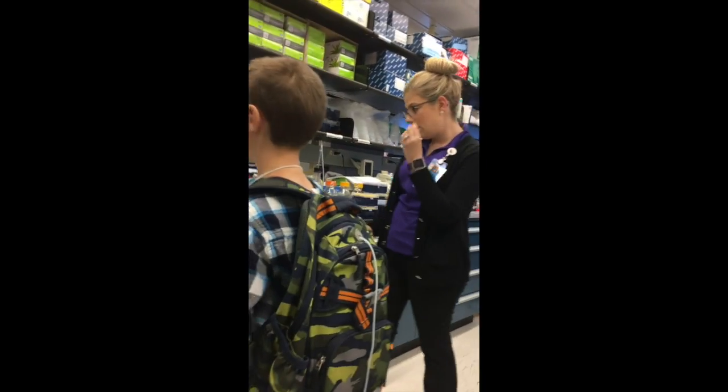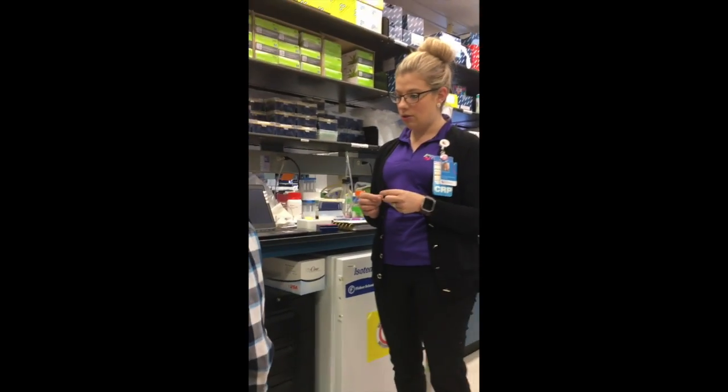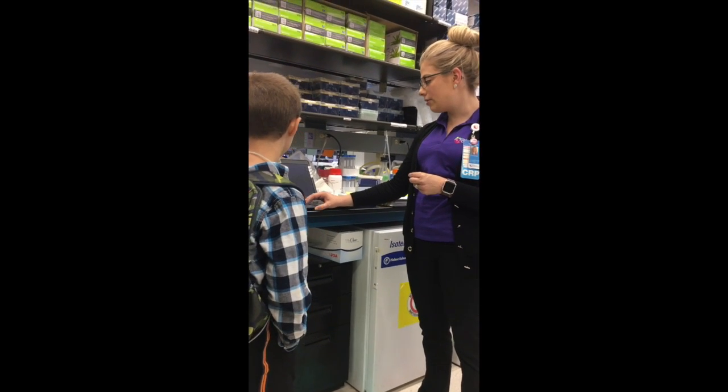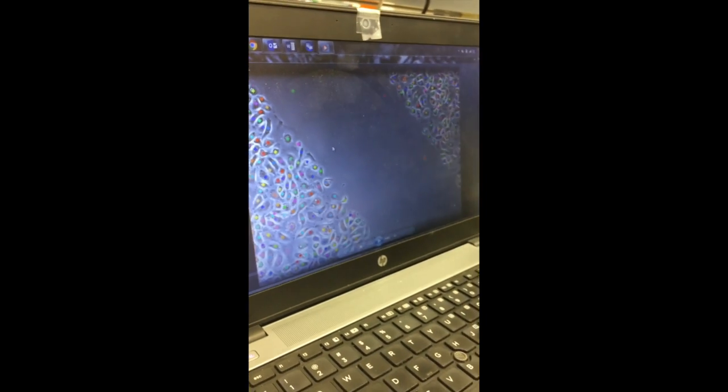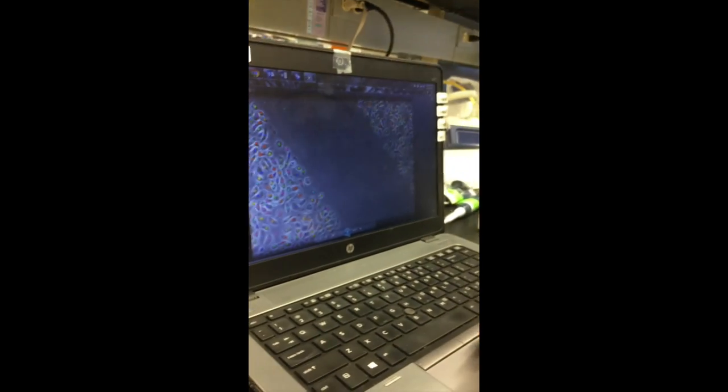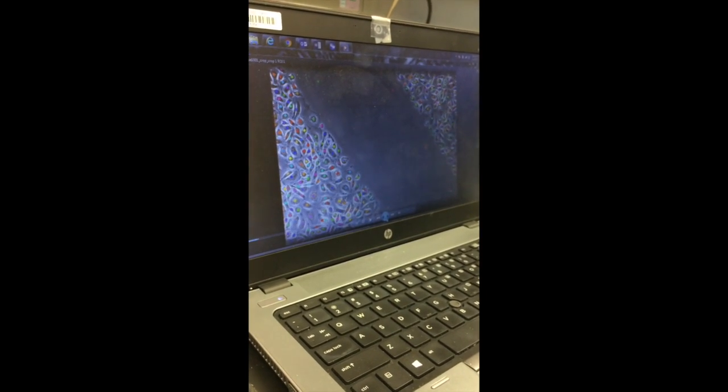Alright, so I'm going to show you a little bit of other things that we do. We like to take that small little biopsy that I showed you, and we cut it up into smaller pieces and grow millions of cells from them. So we put them on a plate. Dr. Rockman did this, and this is a barrier that we've put here, right? Think of it as a wound. Like if you cut yourself, and these cells on either side have been hanging out there until you remove that barrier, and then we wanted to see what would happen with those cells and if they would move to overcome that barrier, and they actually do.